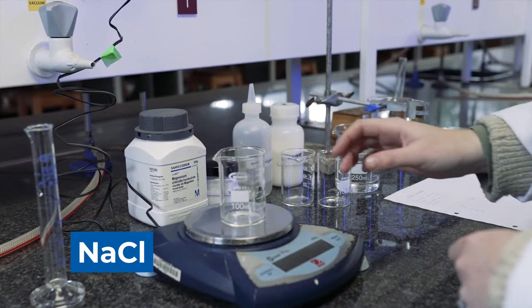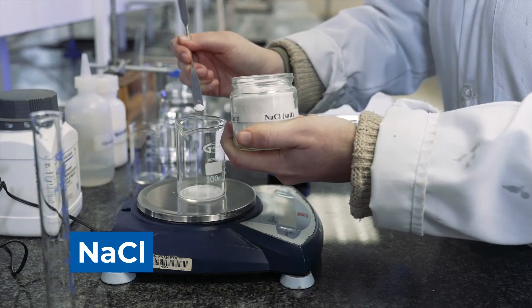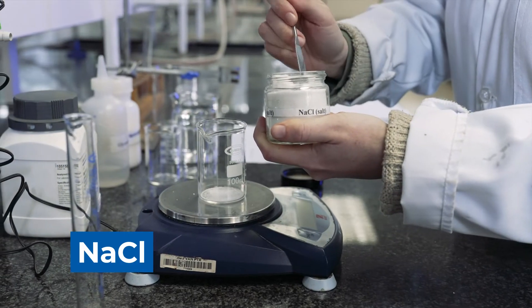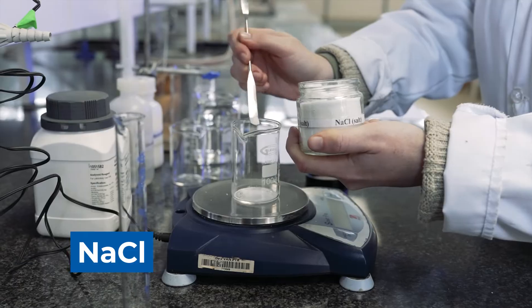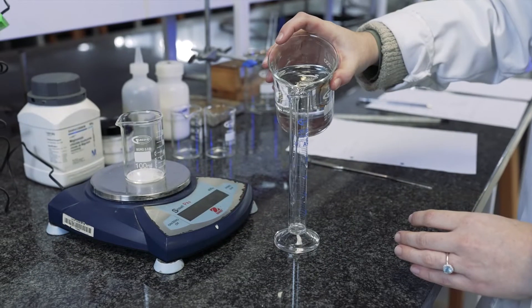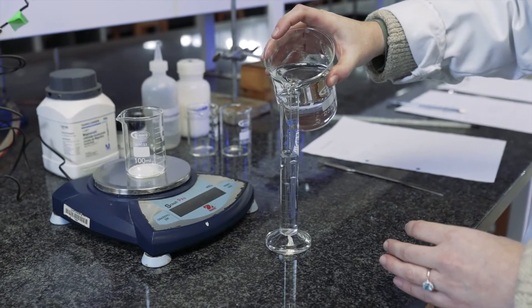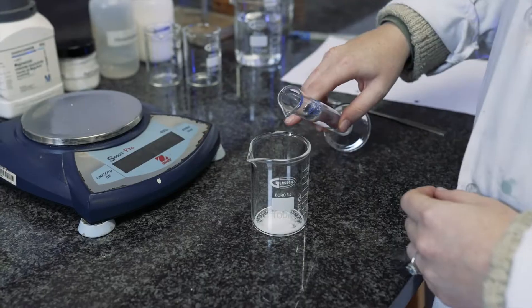Now that we've weighed the sucrose, the next one will be sodium chloride. We're going to repeat the same procedure with the distilled water by adding 25 milliliters.